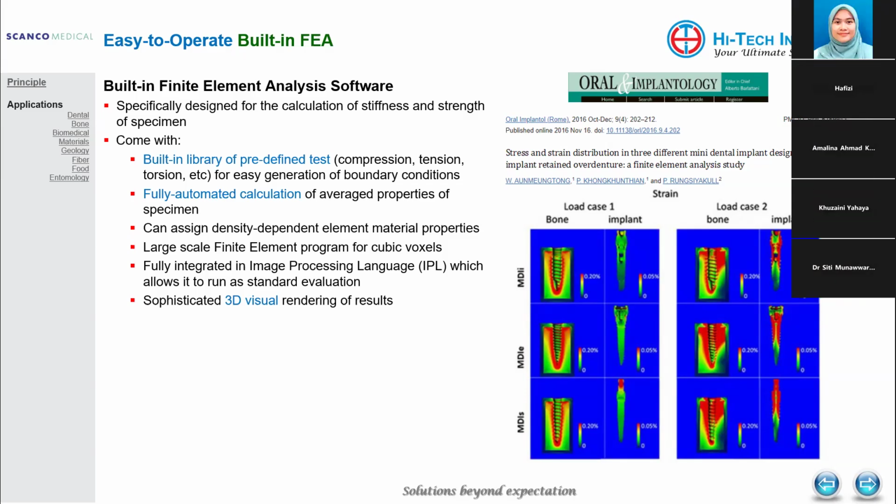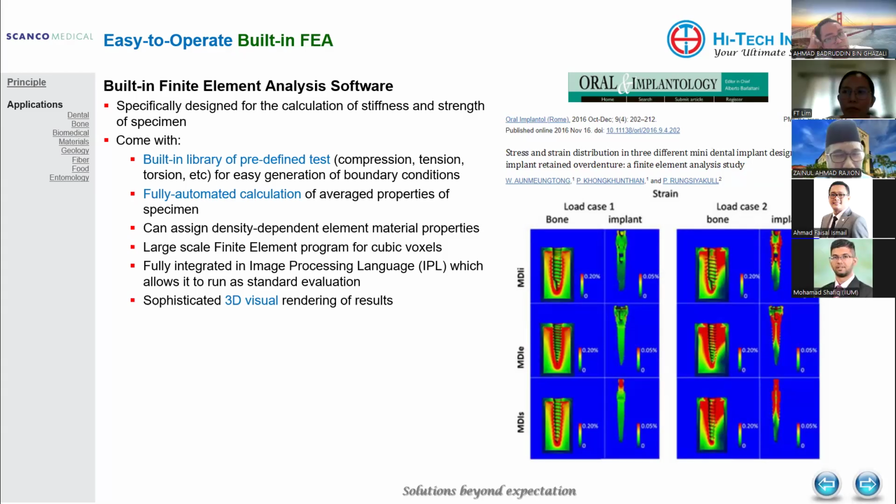They are all doing research based on materials and dental materials. So I think it's good that we can have MicroCT to further analyze the data in terms of clinical application later on. So I think it's good that we can further discuss.